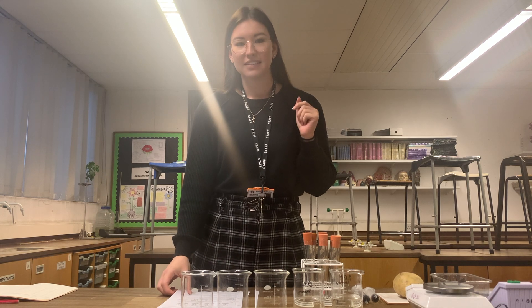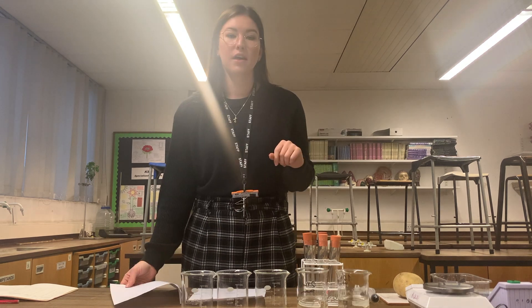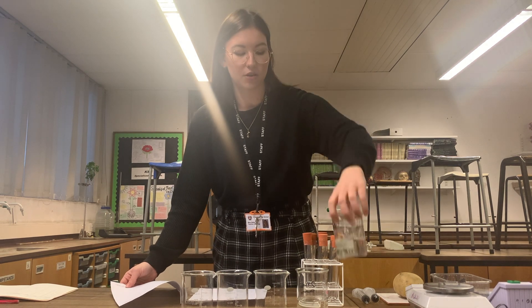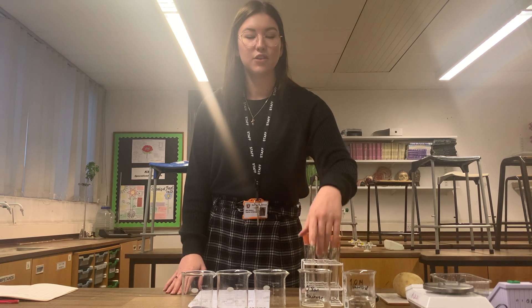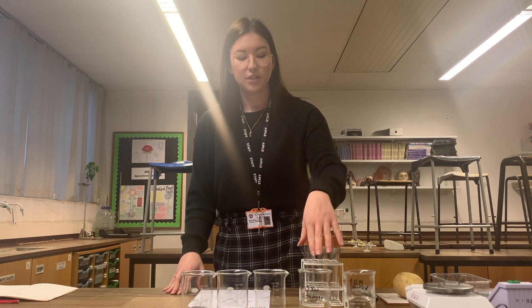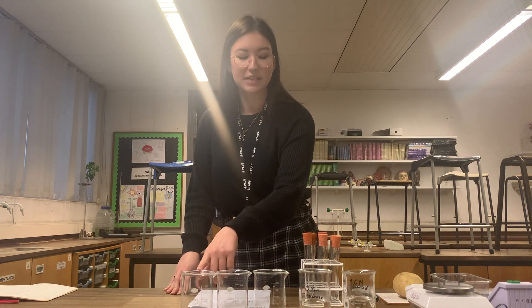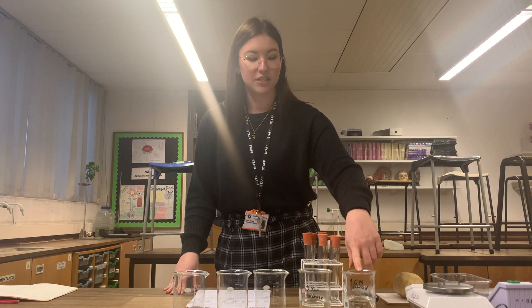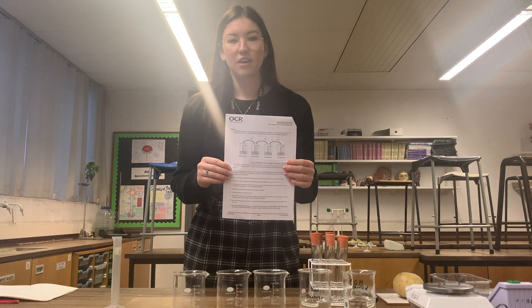The first step is to make a serial dilution to have our different concentrations of sucrose solution. I'm starting with two sucrose solutions: 1 mole per decimetre cubed, and 0.8 moles per decimetre cubed. It's the 0.8 mole per decimetre cubed sucrose solution that I'm going to use to make my serial dilution. I need to end up with 0.4, 0.2, and 0.1 moles per decimetre cubed. I already have my 1 mole per decimetre cubed solution, and I will need some distilled water. I have a diagram to help.